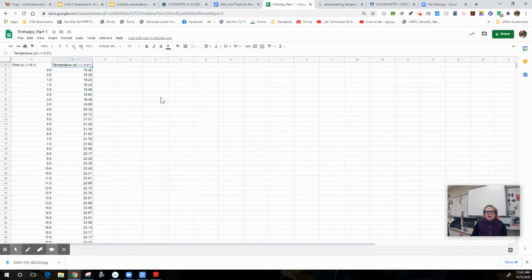The reason why I'm going to graph for this lab is because even though I can see the initial temperature at time 0, and I can scroll all the way down and find the maximum temperature way at the bottom, we have to assume that this reaction happens instantaneously. So that's not captured when you're collecting data on a Vernier because over time that temperature changes. We want to pretend that the temperature change happens instantaneously, so it goes from a minimum temperature to a maximum temperature all in almost the exact same time period.